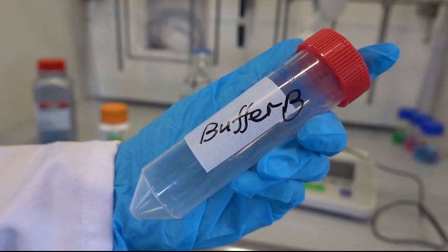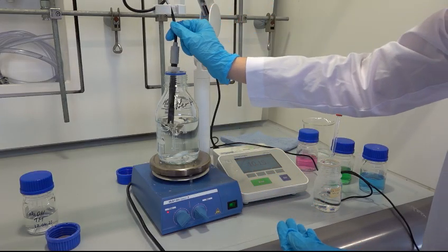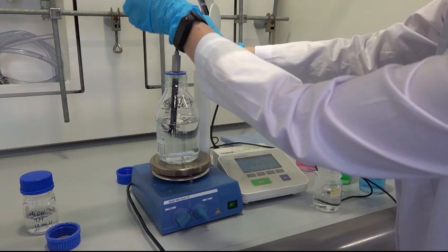In the next step, the pH of buffer A should be adjusted. Before we begin, turn on and calibrate the pH meter.